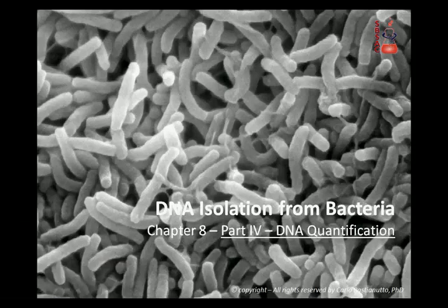Hello everyone. So this is going to be the last screencast actually of this semester. What we're going to discuss in this screencast is how you can quantify DNA and how you're going to be quantifying it in this lab this week.